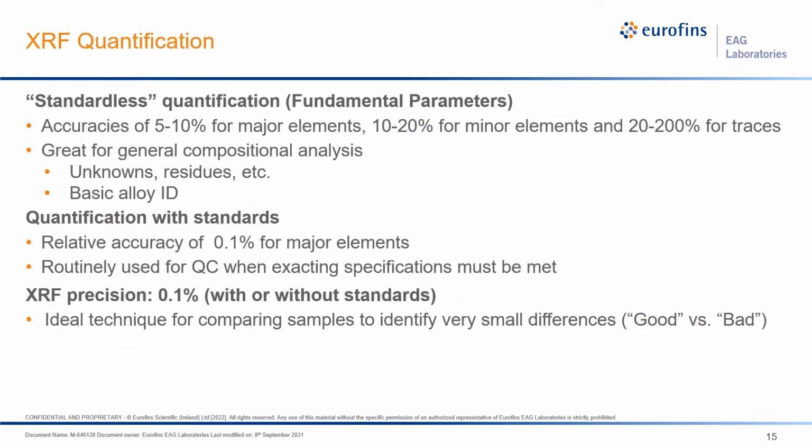So let's talk about quantification using XRF. With an all-purpose analytical services lab, such as EAG, we never know what might be coming in the door. As I said earlier, XRF is often utilized as a kitchen sink technique, analyzing everything but the kitchen sink, or the kitchen sink as well.